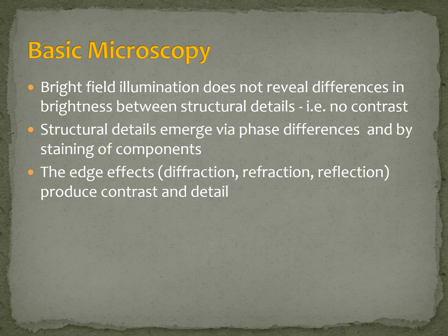So basically in this presentation what I've been telling you is how microscopes were developed in the beginning, but just a simple microscope. So I didn't tell you about immunofluorescence or other techniques. We just talked about bright field microscopy, where you don't use any stains, we just illuminate the samples, and it's very difficult through bright field to obtain structural details because usually the samples lack contrast.